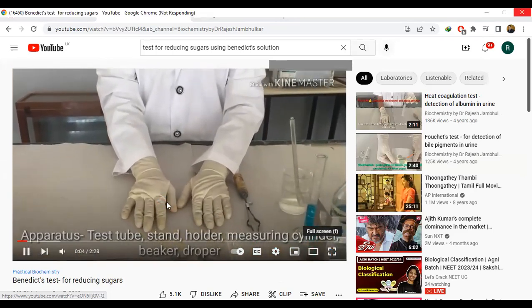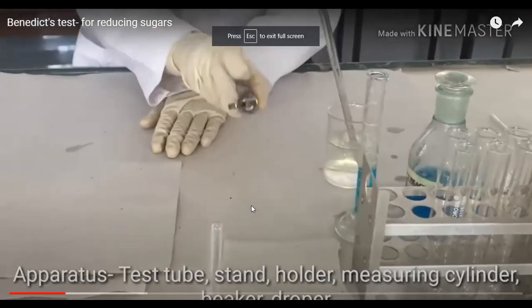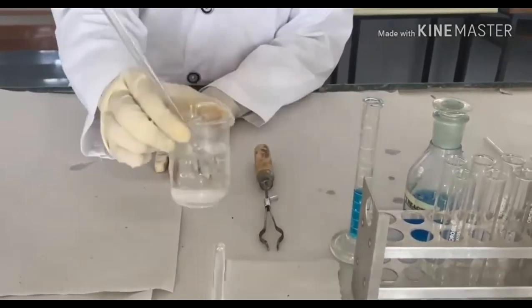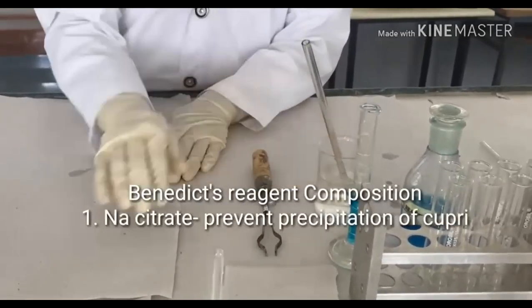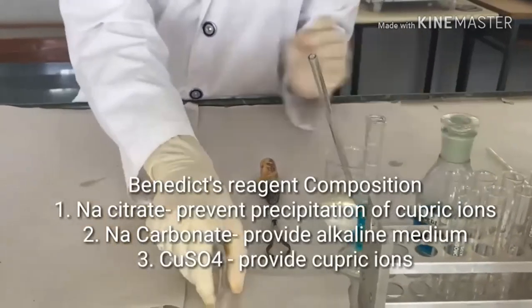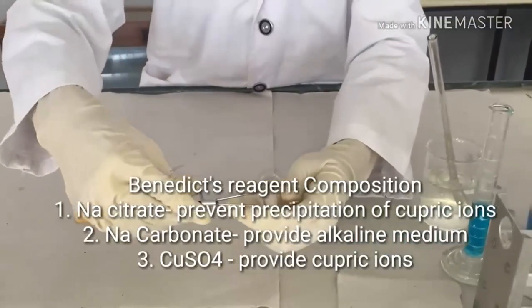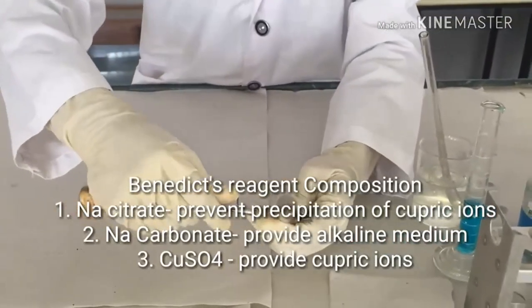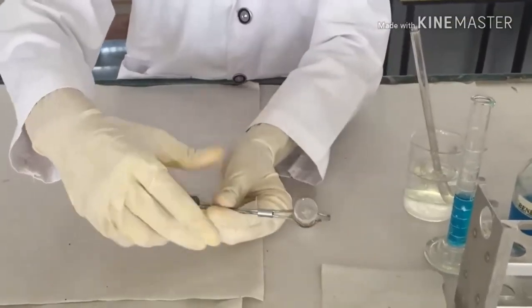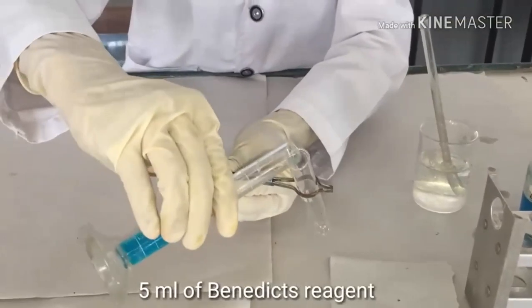The apparatus used for this test are a test tube stand, a test tube holder, a measuring cylinder, and a beaker containing the sample. The reagent used is Benedict's reagent. Take a test tube and hold it firmly with a test tube holder. Add 5 ml of Benedict's reagent.